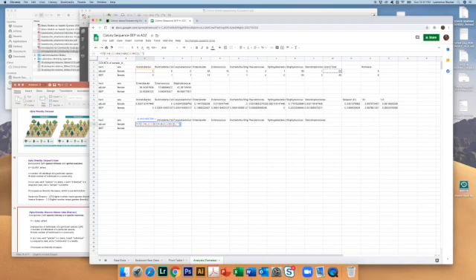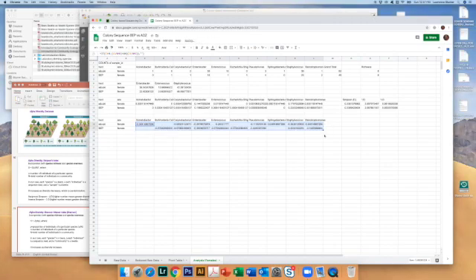Again, these double parentheses here are necessary for this calculation to be done properly. Once you've entered it like this, then hit enter, and it's giving us a value. Click on this and then drag across. That is, stay in that one row and drag across, and it's calculating the values. Notice where there are zeros, it's just leaving blanks. That's what we want. Once you've done that and you've got the whole row selected, grab that little box and drag down, and it'll do the same calculation for the other row.